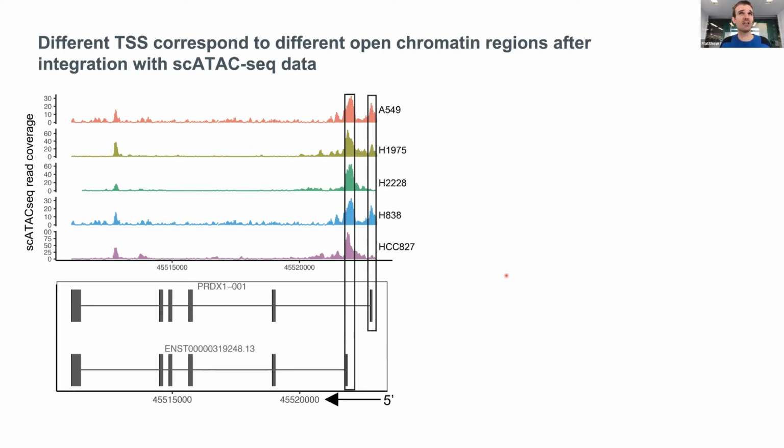And if we aggregate the ATAC signal across the different clusters in our data, you can see very distinct peaks. So, quite a big secondary peak in this first cell line, the second one, and the fourth one here, whereas the third and the fifth have low peaks or no peaks.